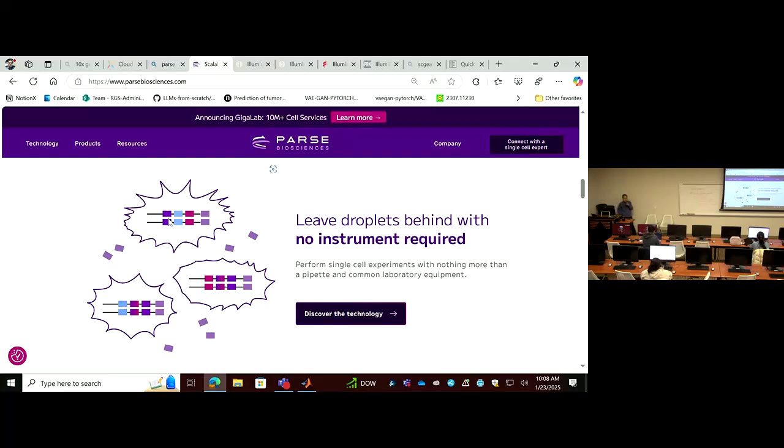My lab used this technology before, but although they claim there's no equipment required, there is still the labor cost or the training for the technicians. You need to learn how to transfer mixed cells and transfer to another plate. This procedure also takes 2 days.